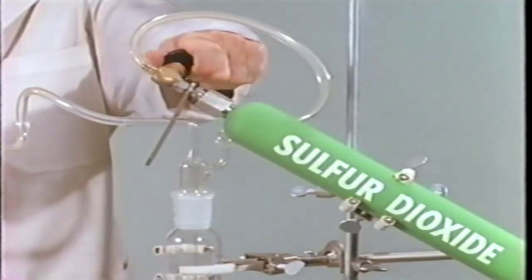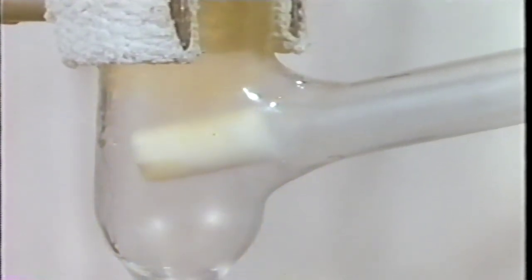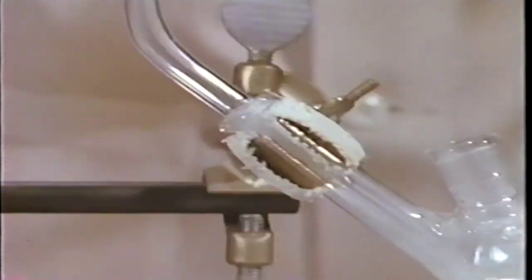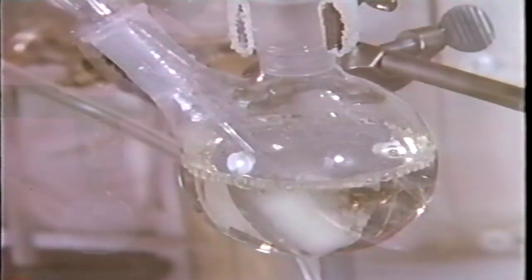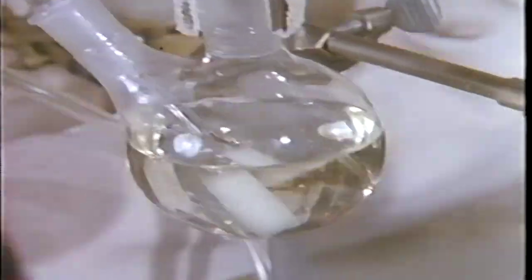The sulfur dioxide is added through this tube and mixes with the bromine and water vapor coming down the column. The bromine color disappears, and colorless hydrogen bromide gas is formed, which passes into the water in this receiver. After a few minutes, the seawater solution loses its color, showing that the bromine has been swept out.